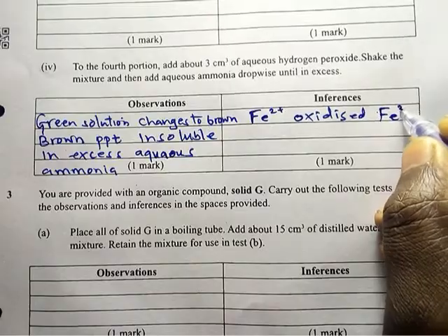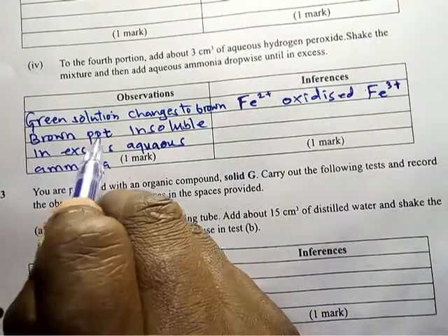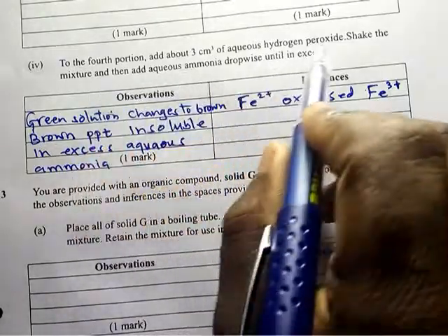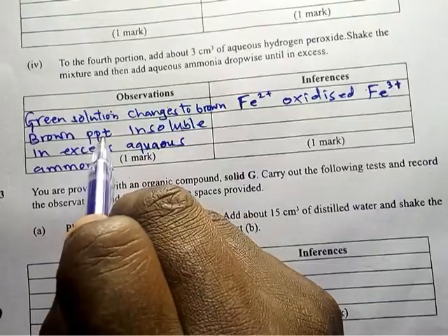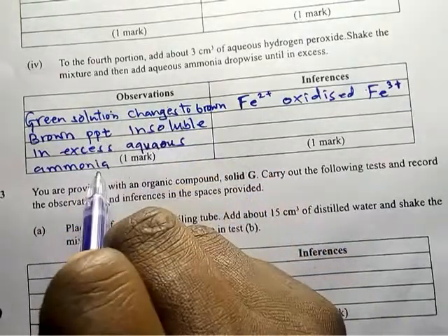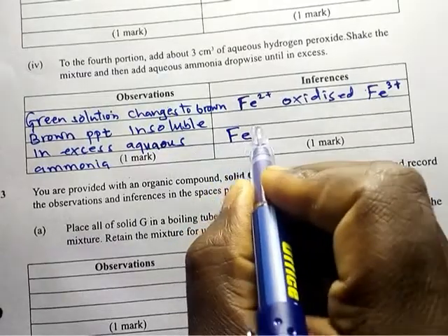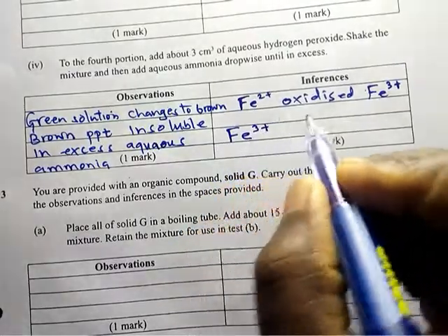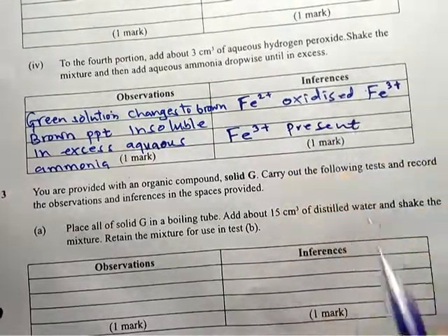Then, on addition of the ammonia dropwise until in excess, a brown precipitate is formed which does not dissolve in excess. That confirms that iron 3 is present. Fine.